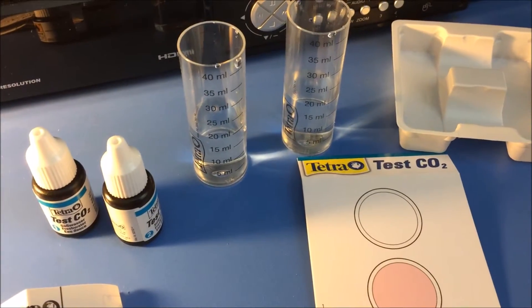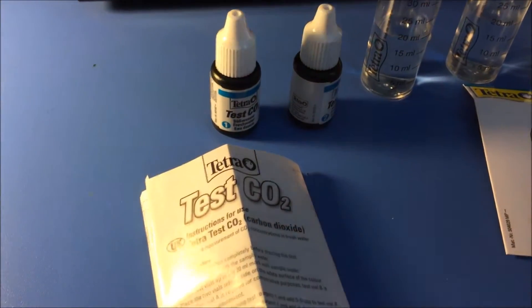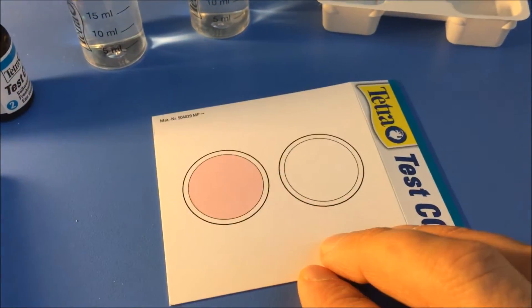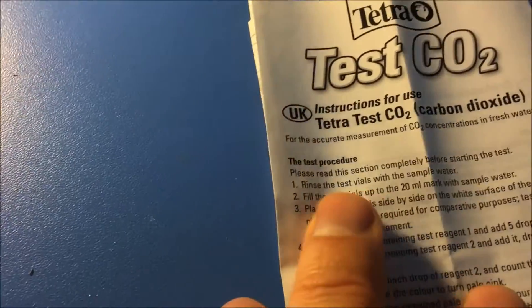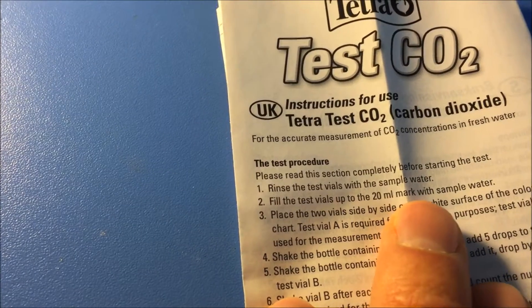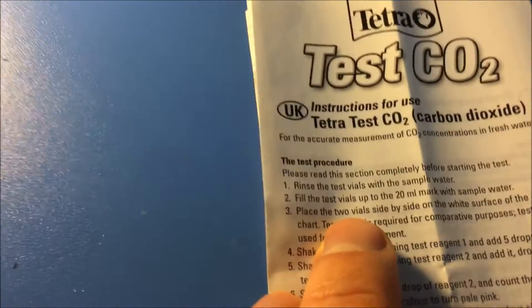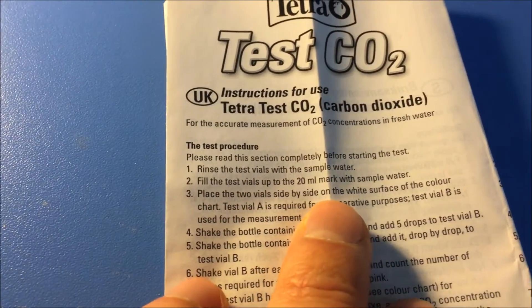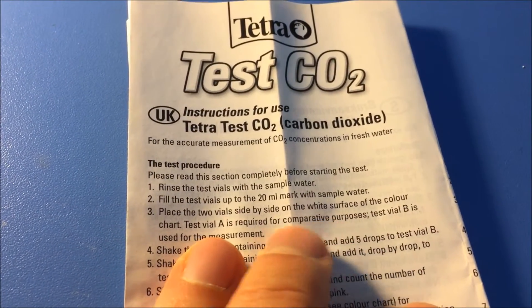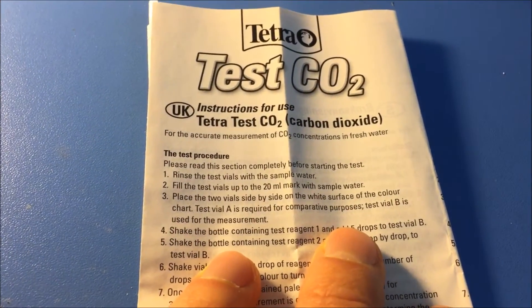Inside the test box I found two vials and two solutions for testing, and a color chart. The instructions say: rinse the test vials with sample water, fill them up to the 20 milliliter mark with sample water — I've already done that. Then place the two vials side by side on the white surface of the color chart. Test vial A is for comparative purposes; test vial B is for the measurement.